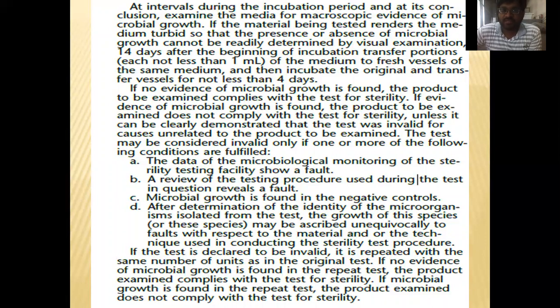So 14 days after the beginning of the incubation, transfer portions of not less than 1 ml of the medium to fresh vessels of the same medium, and then incubate the original vessels for not less than 4 days. If no evidence of microbial growth is found, the product examined complies with the test for sterility. If evidence of microbial growth is found, the product examined does not comply with the test for sterility, unless it can be clearly demonstrated that the test was invalid for causes unrelated to the product examined.